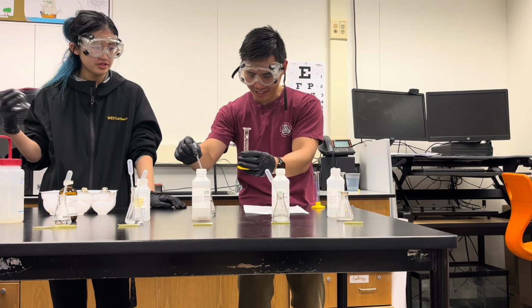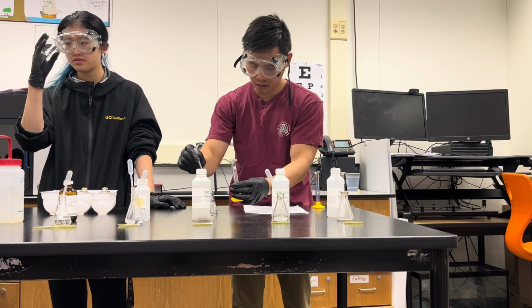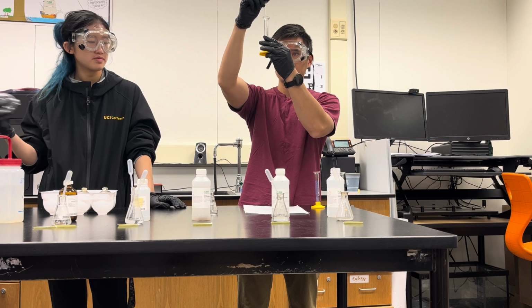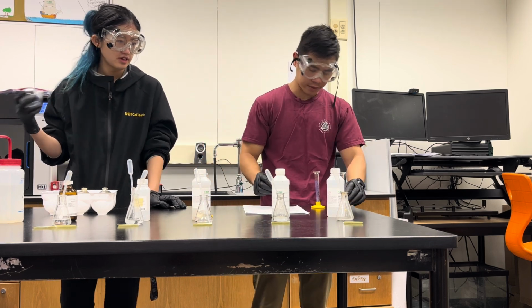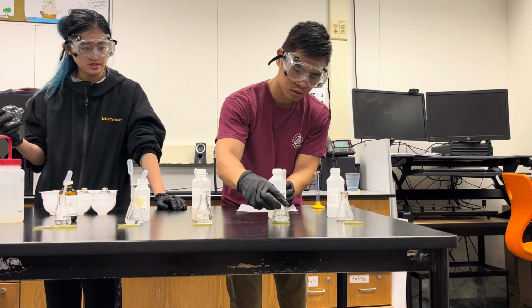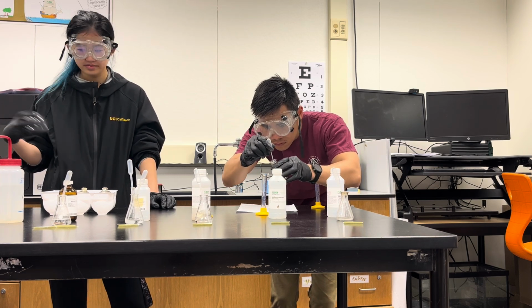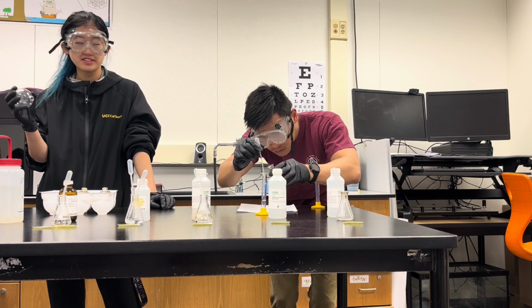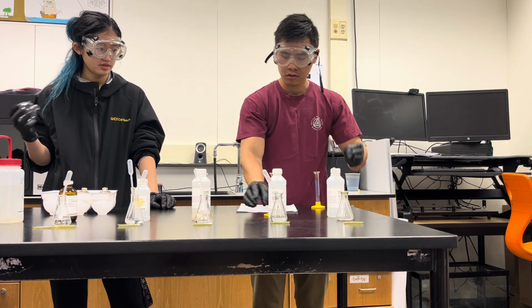Into this graduated cylinder. Okay, I'm gonna leave it right behind so that I don't confuse it. Afterwards, also 5. I'm gonna take 5 milliliters of sodium hydroxide, NaOH. All right, and same thing, I'm gonna leave it right behind the bottle so I don't confuse it.